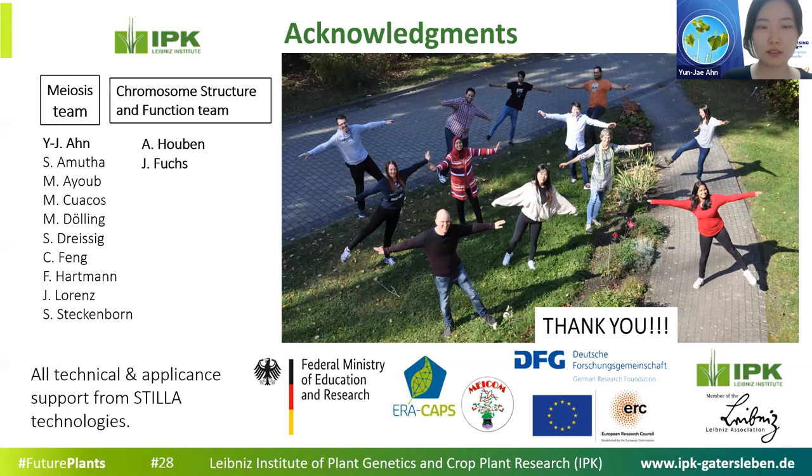Okay, thank you. The next question would be, could you adapt the system for other plants or even other non-plant specimens? Yes, as I said, we tested the leaf nuclei of five different crop plants and Arabidopsis. We only tested encapsulation in there, but we also had the opportunity to perform a genotyping assay with Brassica, and this was also working very well. So I think it could be easily applied to other crop species.